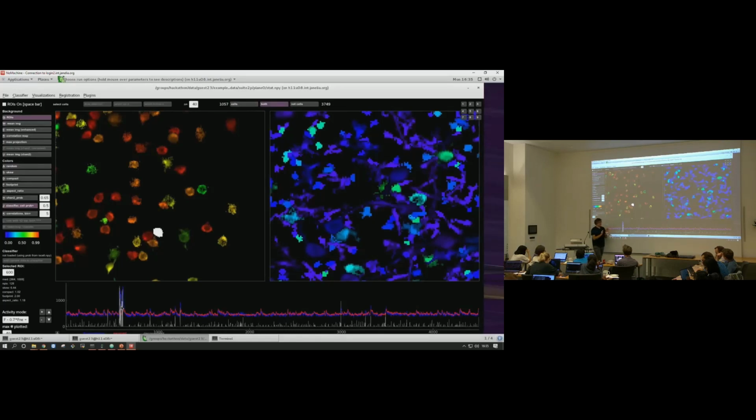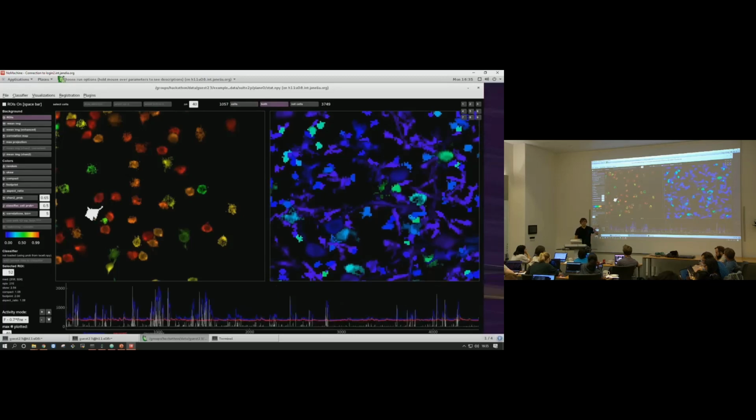Not all the time, right? Sometimes you get high-firing cells that have a lot of signal, and those might actually be the ones responding to your task or your behavior or something. And so those, maybe a little bit more like these ones here, right? So they clearly have transients. They're just not as sparse as the other ones. And so maybe the skewness now is a little bit lower. It's 3 now. Now, if you get into skewnesses of like 0.5 or something.